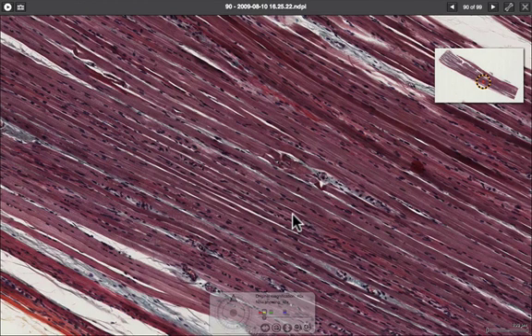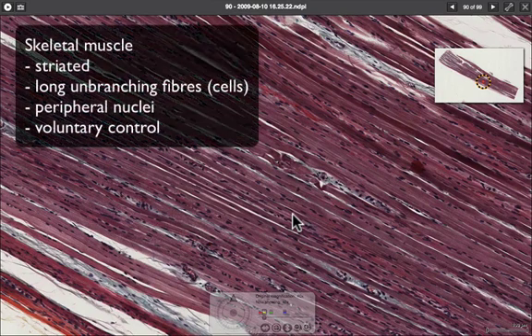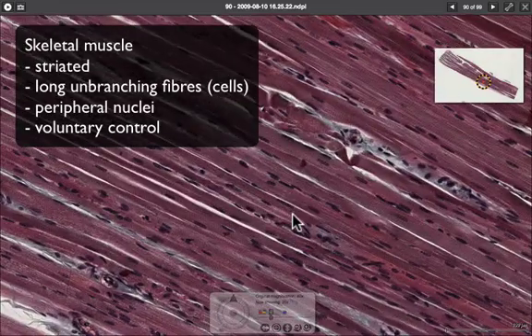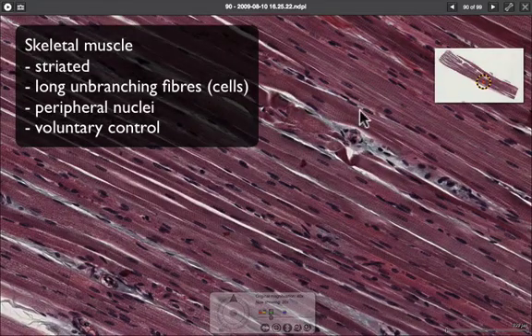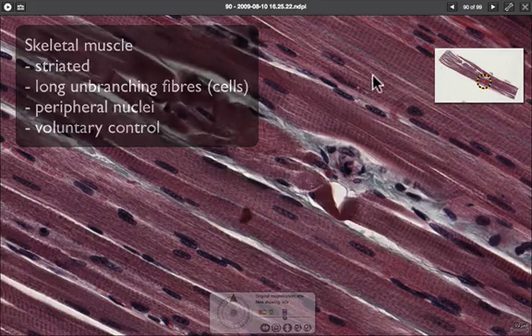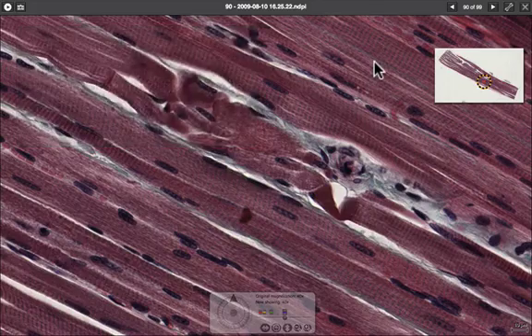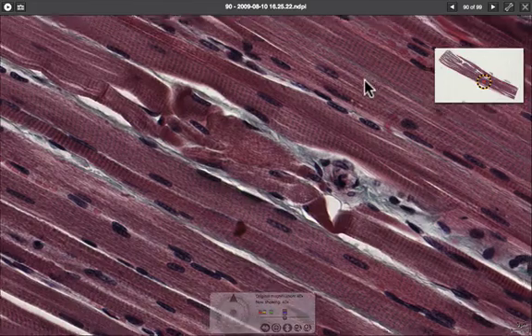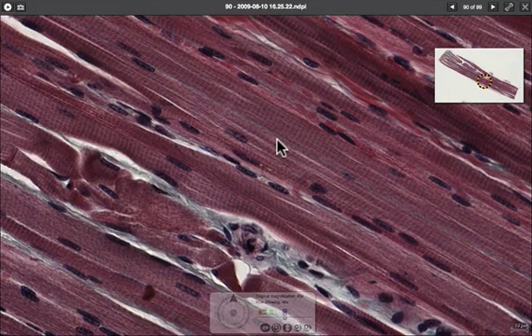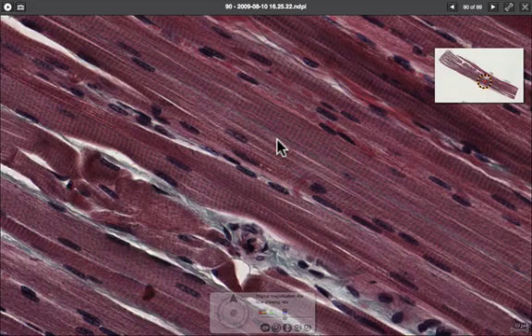We're going to start with skeletal muscle, which is the easiest one to classify. Each skeletal muscle cell is called a muscle fiber, and they're very, very long. The longest one in the body is in the sartorius muscle — it's almost a meter long.